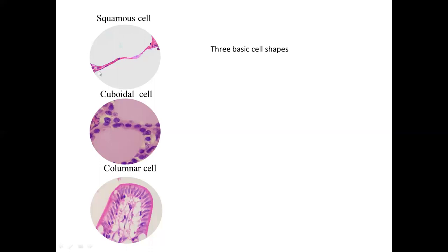When you come for your practical, you should be able to identify lung tissue and identify the squamous cell in a lung tissue slide, and also draw what you see in your histology practical books. The next slide shows you cuboidal cells from a section of the thyroid gland. The light pink areas are the colloid — the amorphous proteinaceous material — and surrounding it are cuboidal cells with nice rounded nuclei and visible cytoplasm.